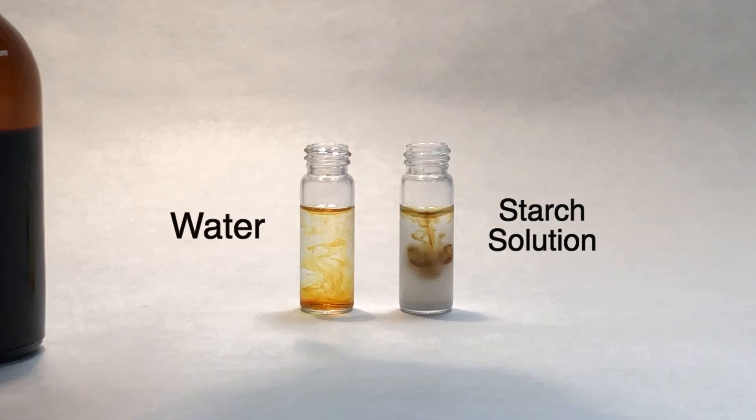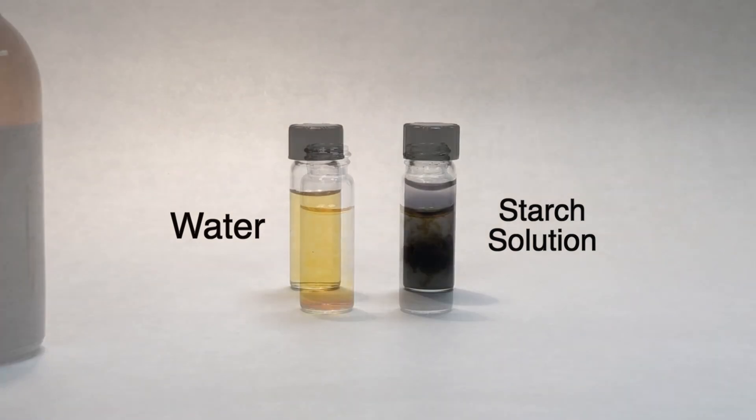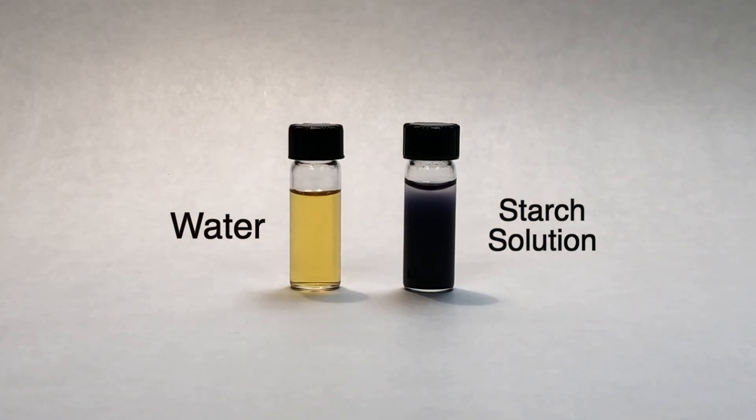When a single drop of the iodine test solution is added to each, the vial on the left turns a yellow-orange color, and the one containing starch turns a black-blue color.